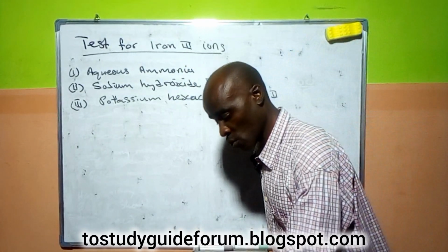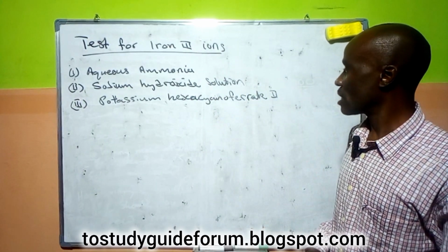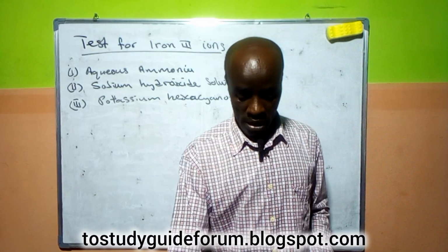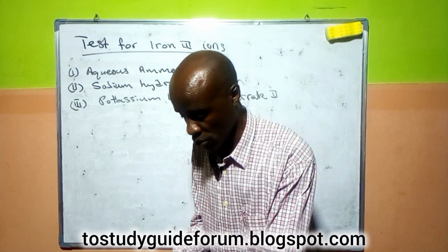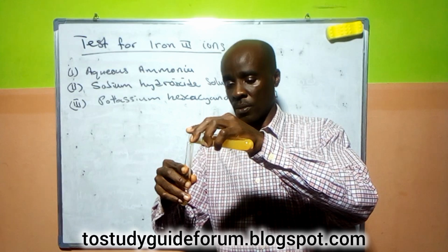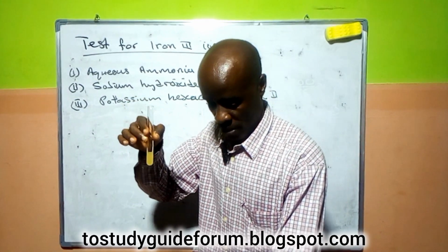So let's deal with potassium hexacyanoferrate 2. With potassium hexacyanoferrate 2, let's see what we are likely to have. A few drops of it. We have our solution.